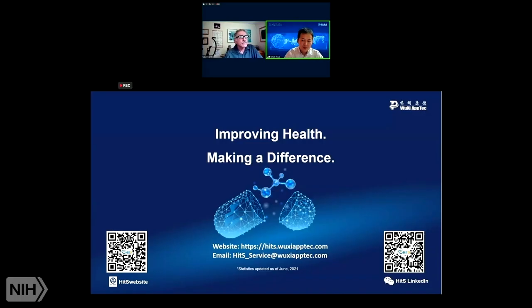Right. I think the sequencing coverage has been used in different contexts, and there are 2 parts of it. One is how much sample do you take out of your selection output, and how much sample you give to the sequencer. As I just explained, if you give it to the sequencer, you better have high sequencing depth, which naturally leads to 100% readout.